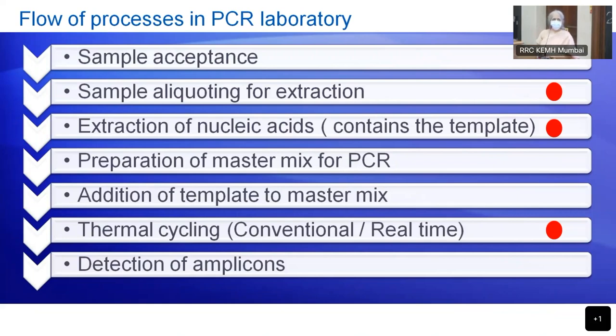Then sample aliquoting for extraction. All of you must have used pipettes, right? How many of you know that while pipetting, aerosols are created? We tried to demonstrate it yesterday in laboratory biosafety, because pipetting creates aerosols to the extent of 10 to the power of 6 particles. So every pipetting act can generate aerosols. While you are aliquoting samples, you are taking the sample and putting it in another room for processing. If you are not careful about the way you use the pipette, you are going to contaminate the next step, because we have this habit of running batches. So we need to be very careful there.